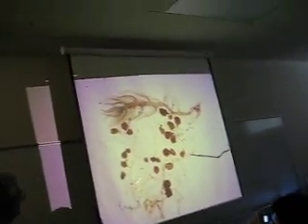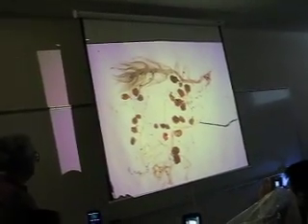Now we're into our first slide, which is number seven — this is moss protonema. So all this stringy yellow stuff is protonema. That's a young gametophyte laying on its side. But this is all protonema. What are these dark orange things? Those are the buds — protonema buds. Each can give rise to a whole plant like this.